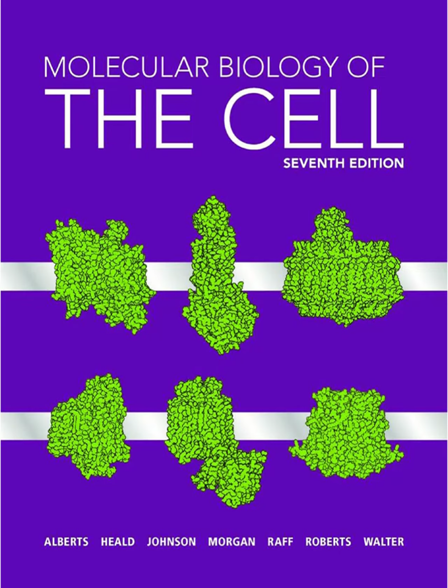The TEM is kind of analogous to a standard light microscope, but scaled up and flipped. You have an electron gun at the top generating the beam, magnetic coils acting as lenses to focus the beam, the specimen stage, and then projection lenses forming an image on a detector at the bottom. And it all has to be under high vacuum. Yes, electrons scatter off air molecules, so the entire column has to be evacuated, which is a big part of why sample preparation is so challenging.